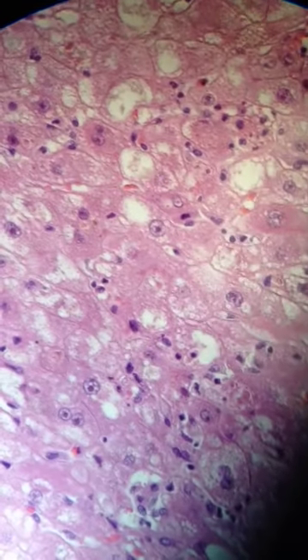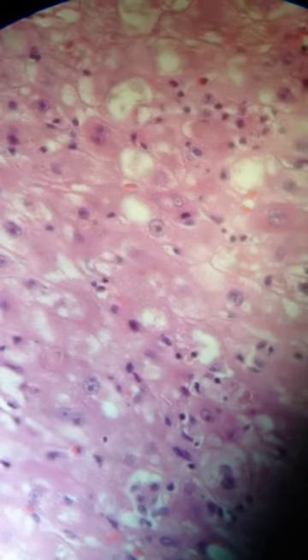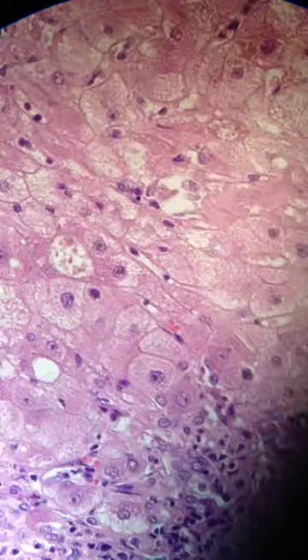I wonder if you could vary the focus on the phone — kind of like zoom in and out. The focus is an issue: I get it in focus and then it drifts. We have that problem with the scanners but we have software to compensate. That's what you'd be up against. This is really cool — would you mind taking a picture of my phone sitting in there with your phone?